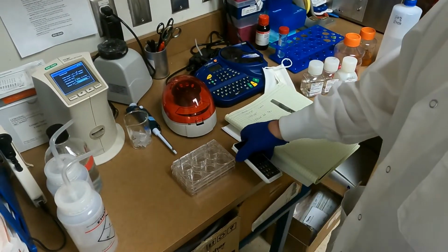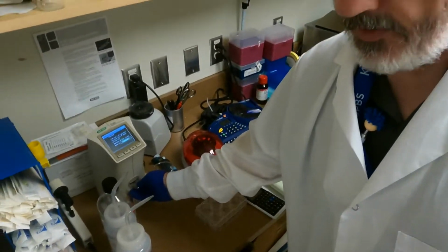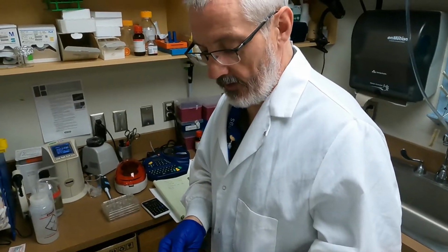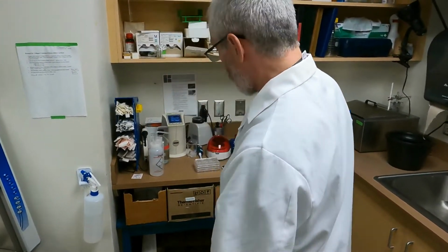But first I want to give them another wash in the PBS, because that helps to get rid of any RNases. And then we'll gently spin them down in an Eppendorf and take them up in the buffer R for the electroporation. Good.